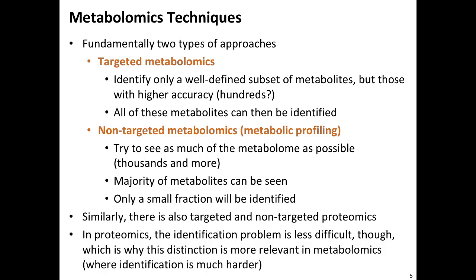That can be interesting, but it's a very narrow view, and it often covers only specific aspects like central carbon metabolism, parts of fatty acid, amino acid metabolism. And if whatever you're after is not really part of this small hole in the metabolome that you look through, then you will just not see it.